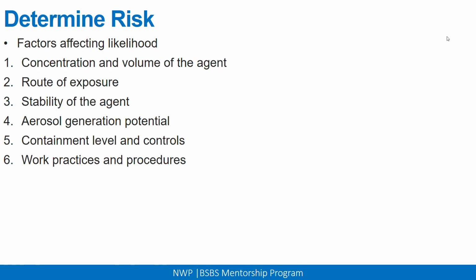Work practices and procedures. If you have poor work practices, mostly safety work practices, you will be increasing the chances of getting exposed to whatever is in the laboratory. Imagine you are testing for an organism that can remain stable in the environment for 2 weeks.